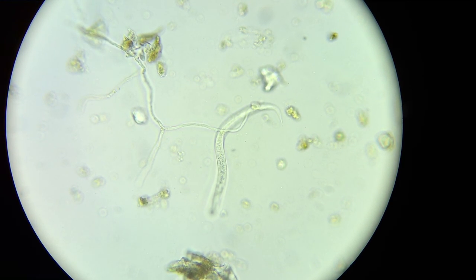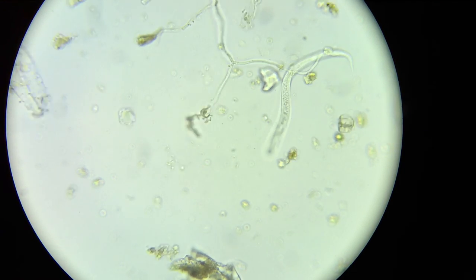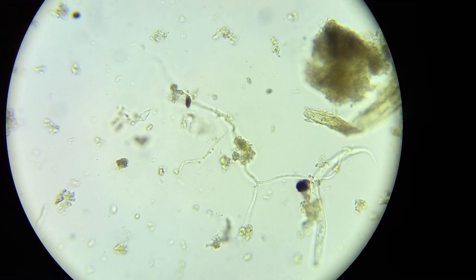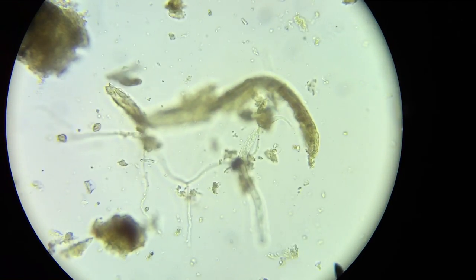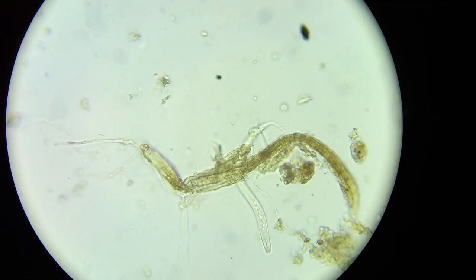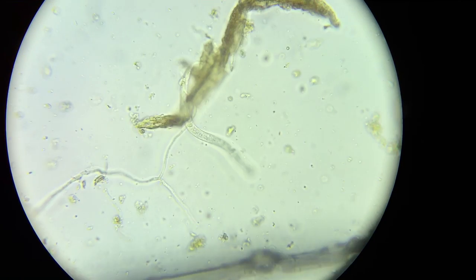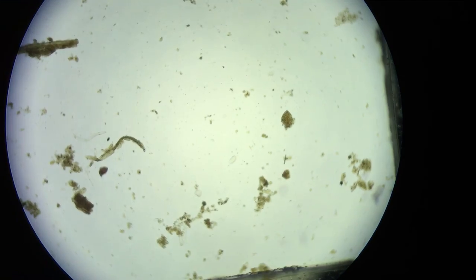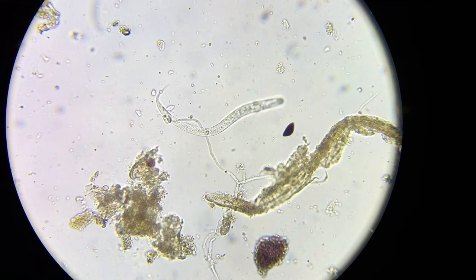Some just have these sticky bulbs. One way to test that that's what's really going on here — I'm going to tap this slide with a straight pin and just agitate it a little bit. Looks like that nematode and that fungus are really stuck together. They're not just in the same place. Well, now it's stuck to something else. I'll just keep pounding on it. That did it — the nematode is still stuck.